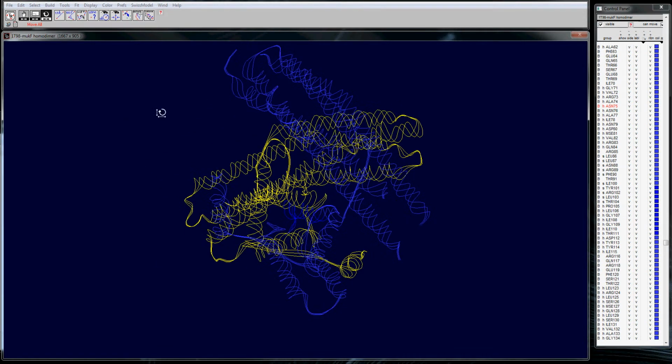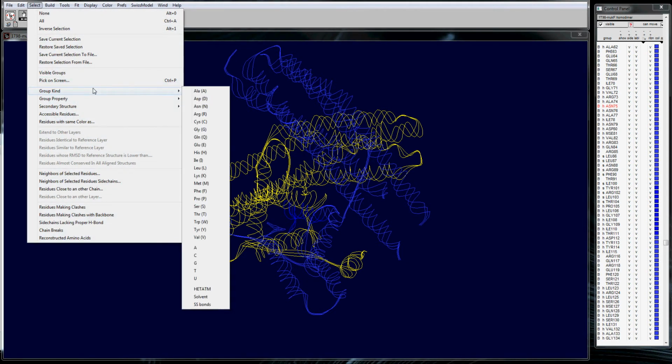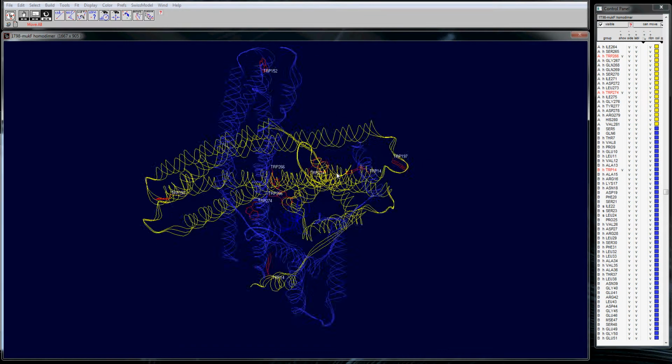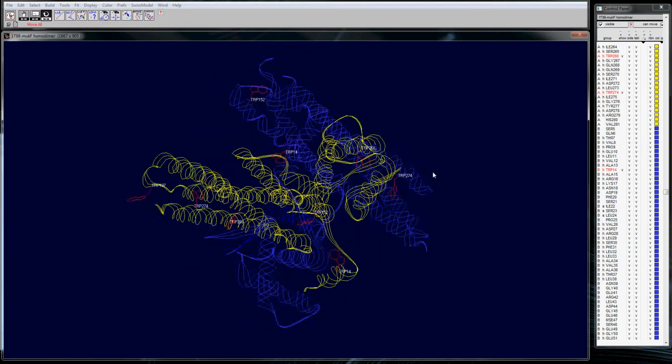So to do that, what I would do is go to select, go to group by kind, and we'll say, how about tryptophan? And so it's now selected all the tryptophans. So if I look through here, they show up. There's one that's red. Here's another that's red somewhere. And then I'm just going to hit show, and then they're all going to pop up. So now all of the tryptophans in my amino acid are there.